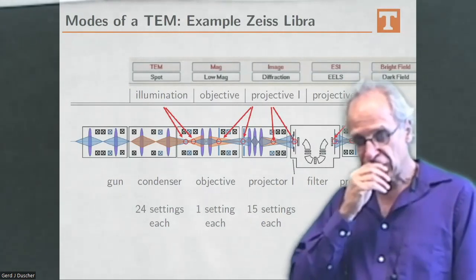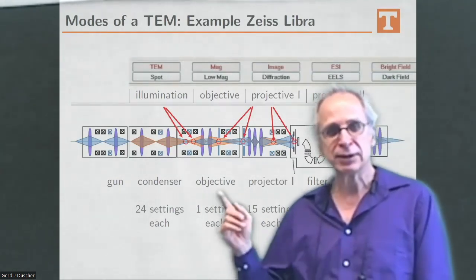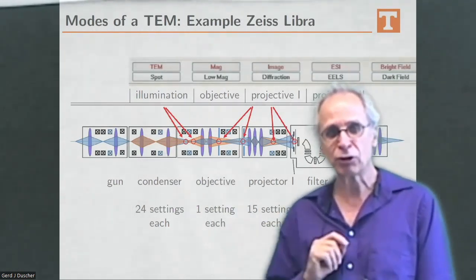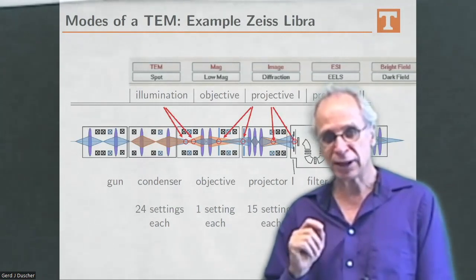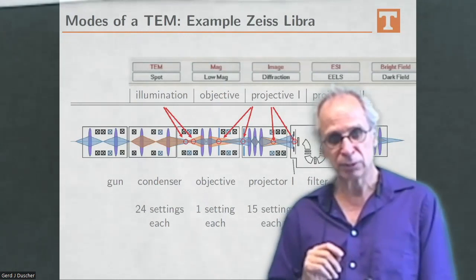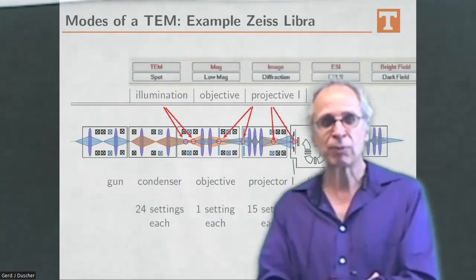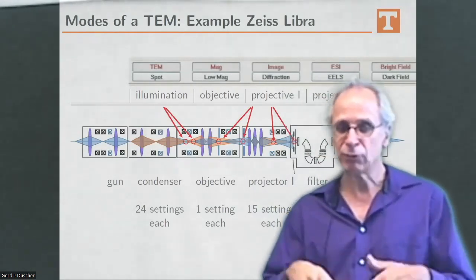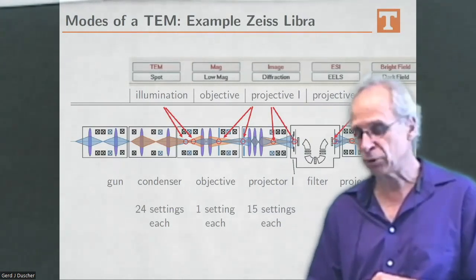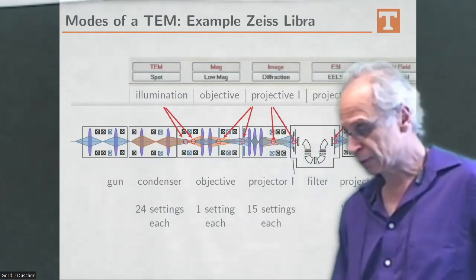And so in STEM mode, we combine the angular one and the position. So we have a beam at a certain position of the sample. And we are in diffraction mode. And then we have both of this information simultaneously, which is the 4D STEM, which we also talk about in this machine learning course further on. Kevin is going to do that.